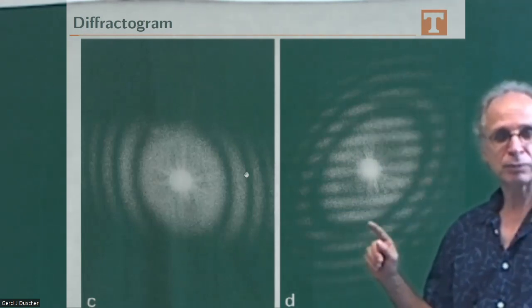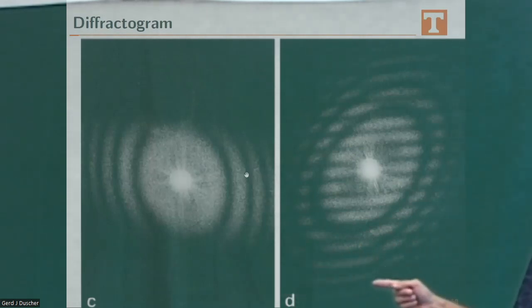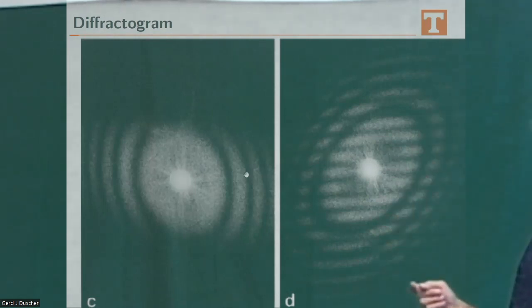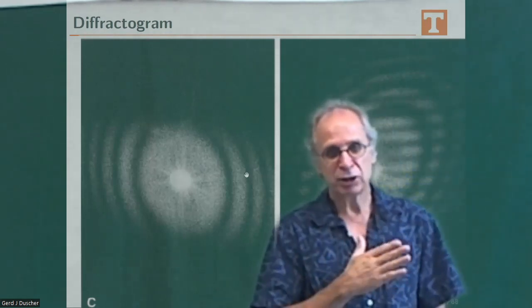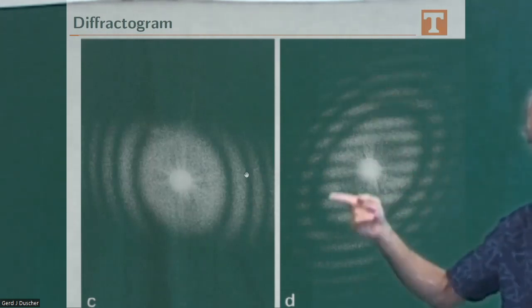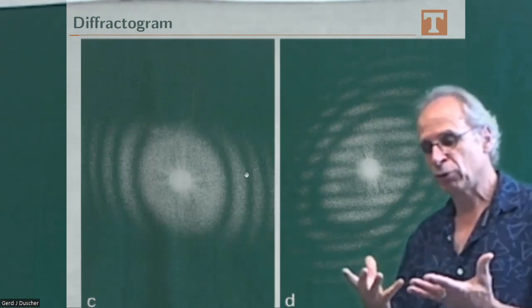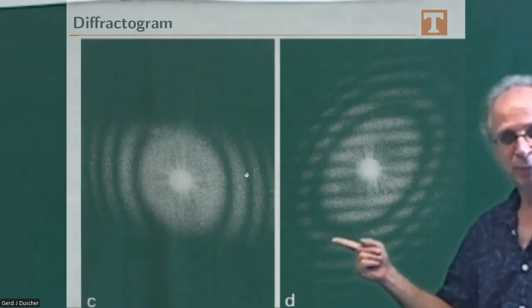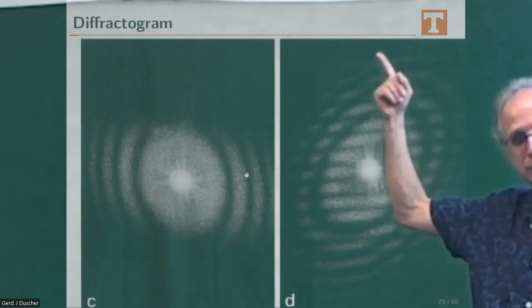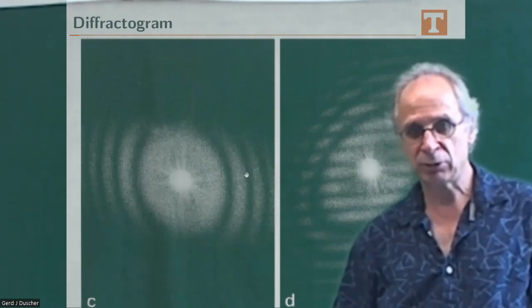What you can do is you can shift the sample, and this is how we determine the information limit. So you see, we introduce some amount of instabilities by shifting the sample very rapidly. And so we shifted it in this direction. So we have now our periodicity in that direction. So we can see how these instabilities influence our information in the images. And so the last lines that we can see, we would make a profile through that. That gives us our information limit. It's a very easy and straightforward way to determine that.